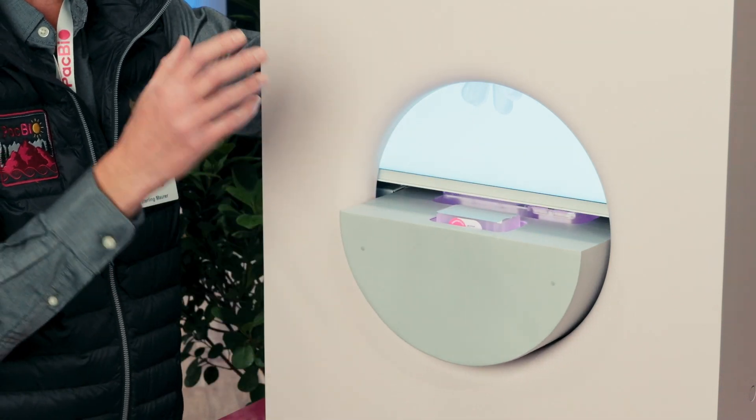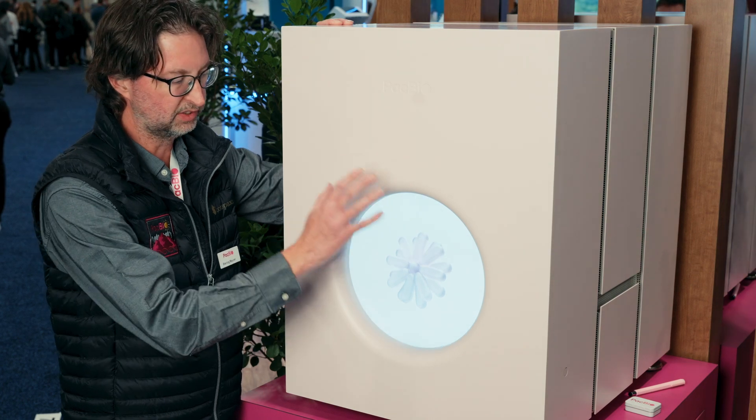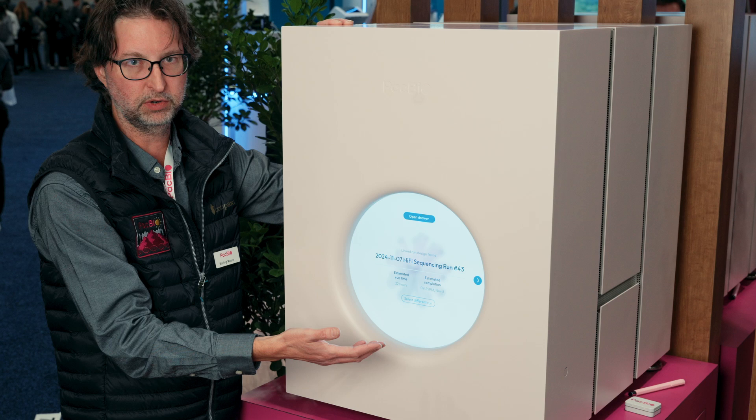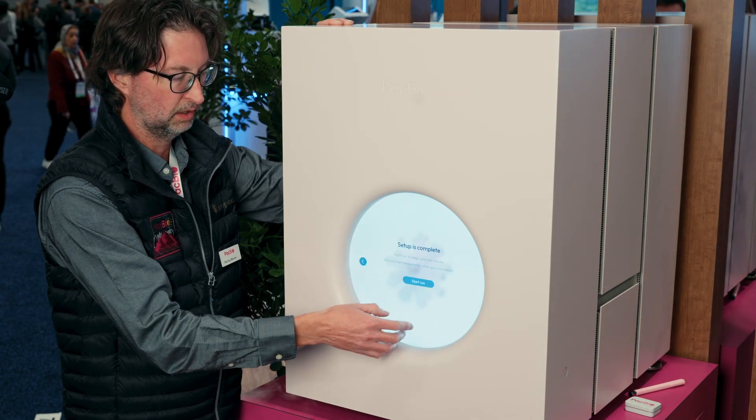You close the drawer and because you've designed your run in SmartLink, it already knows what you're going to sequence. You don't need to set up any run on the instrument. You don't need to pick from a list — it already knows what your run's going to be. You get your estimated run time, when it's going to complete, and then off you go.